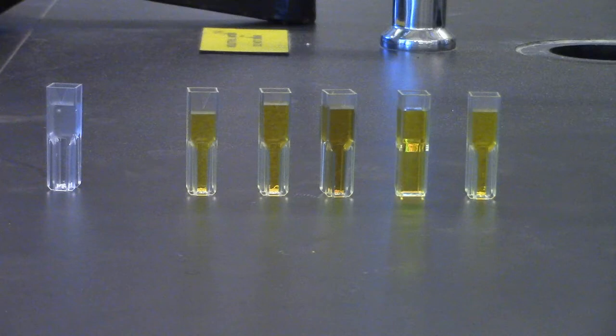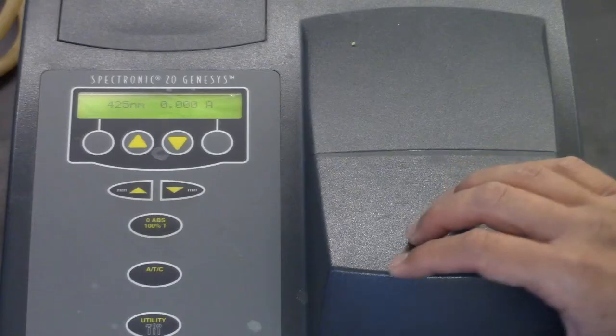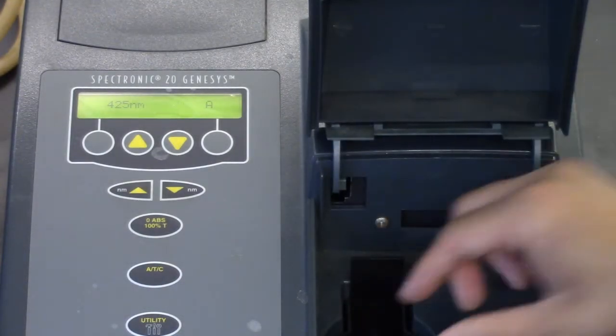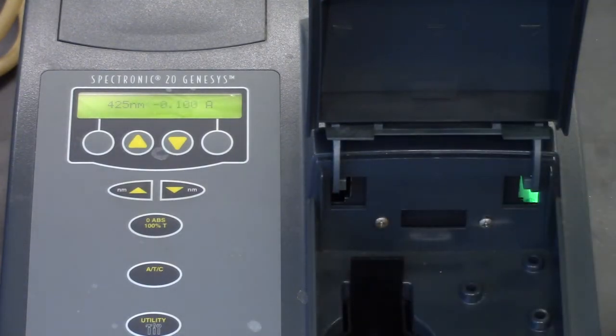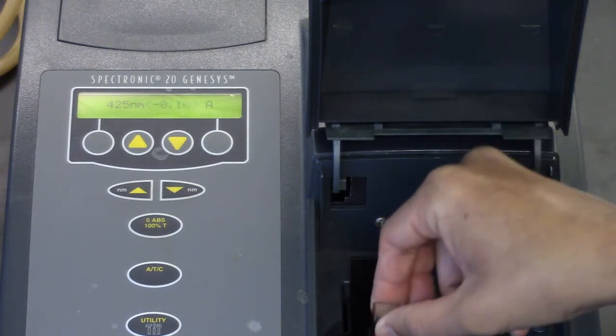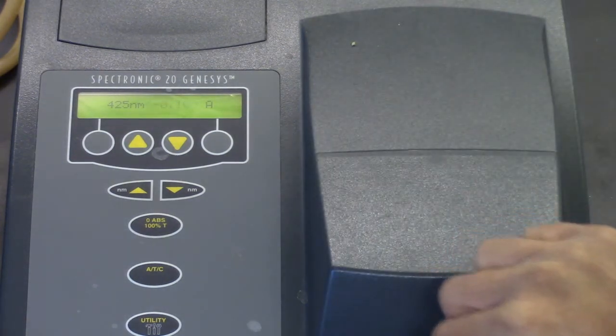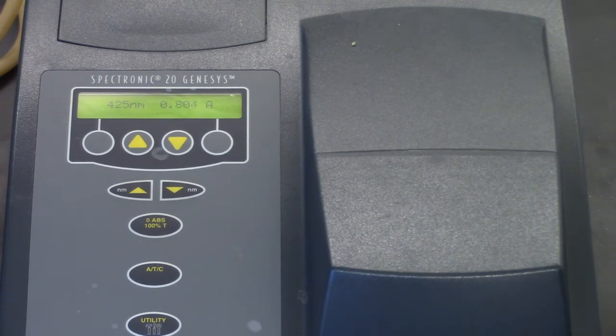You will need six cuvettes, one for each solution prepared for Part A, and one for distilled water, the blank that will be used to calibrate the spectrometer. For the best results, we need to use whichever wavelength has the maximum absorbance. The wavelength will then be used for measuring all the samples in Part A as well as those in Part B.